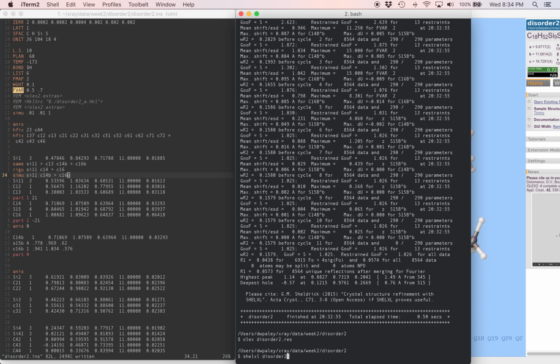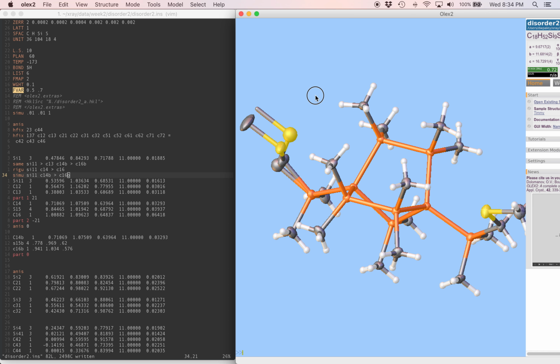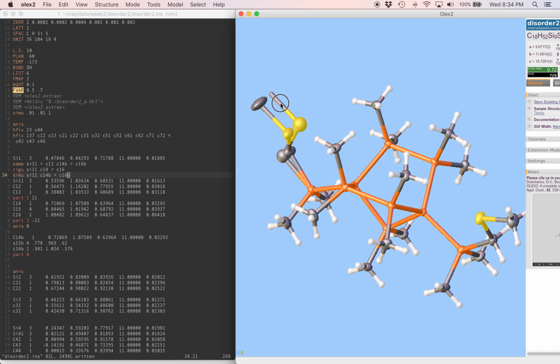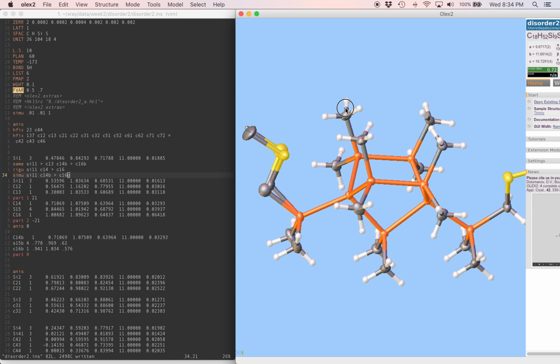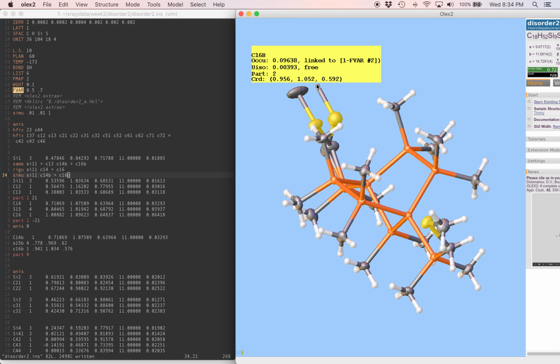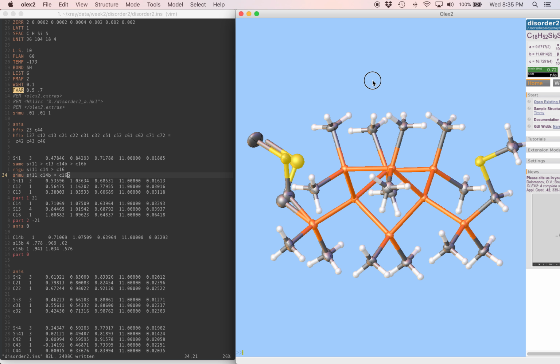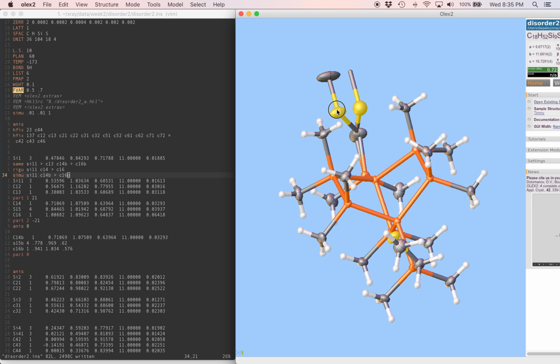Save this and run it again. See if it helps. No, these displacement parameters are not stabilized at all. It doesn't make me worry about the quality of this model, but you don't want to be publishing strange-looking displacement parameters like this. So we better take some other action to make them more reasonable.